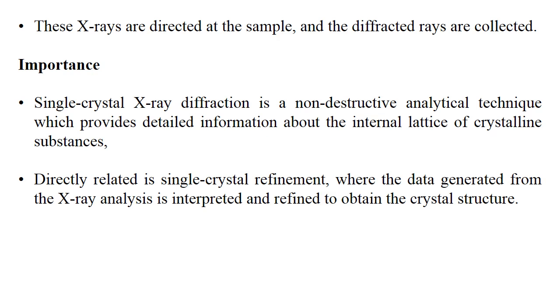What is the importance of X-ray diffraction by single crystal? Its importance is that this technique is a non-destructive analytical technique, as we have discussed in our previous lecture, which provides detailed information about the internal lattice of crystalline substances, including unit cell dimensions, bond lengths, bond angles, and details of site ordering.